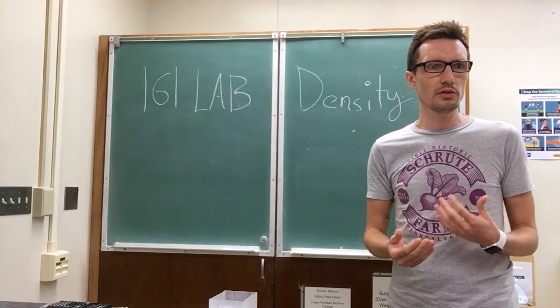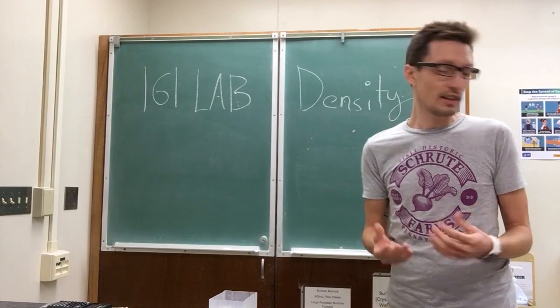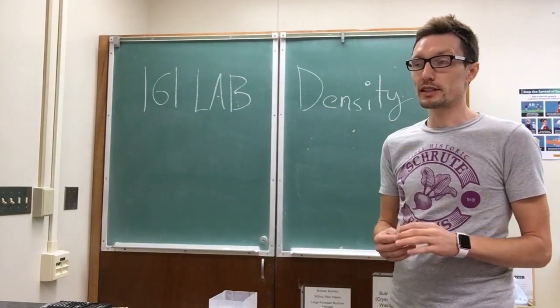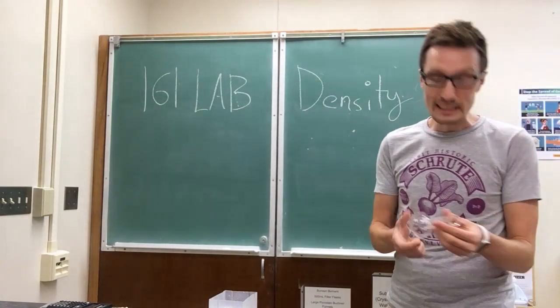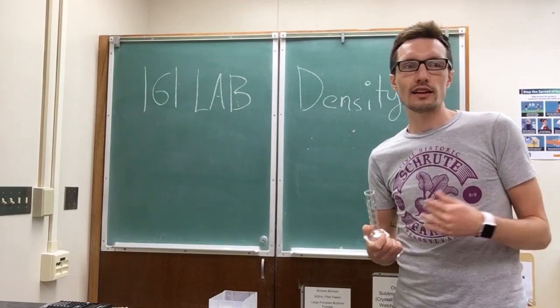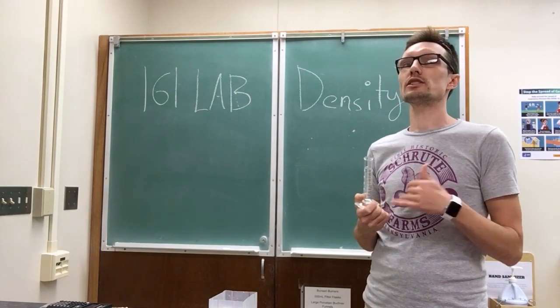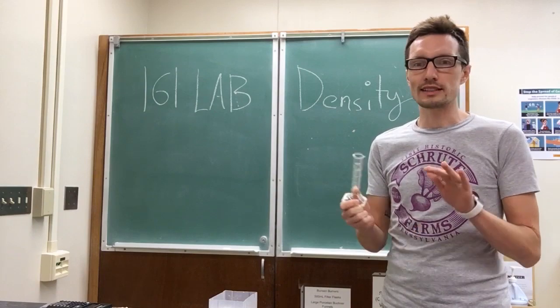Normally what we would do is every person in the class would measure their Teflon ball. Since everybody's different and maybe does things slightly different or is using slightly different equipment, you might get slightly different data. And then we would take that data and run it through statistical analysis, and the statistical analysis will save us for being slightly bad scientists.